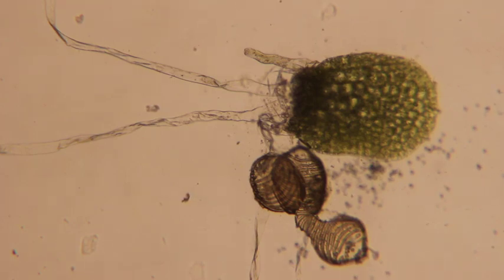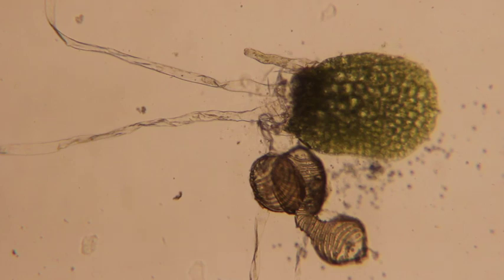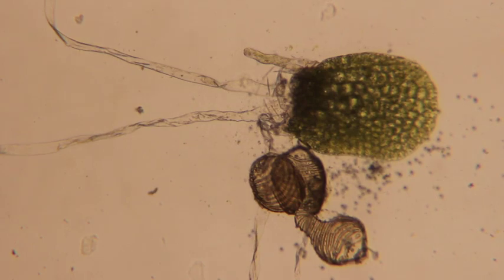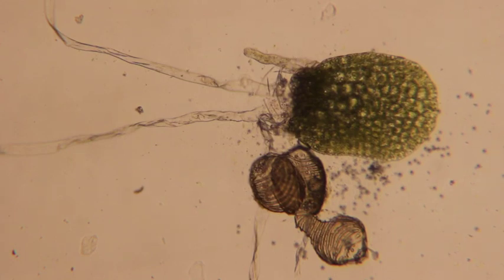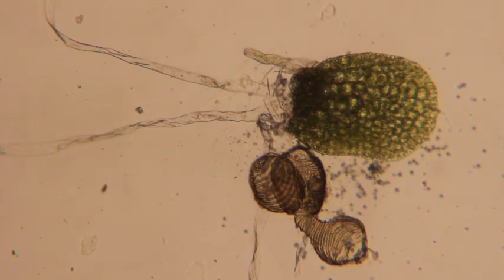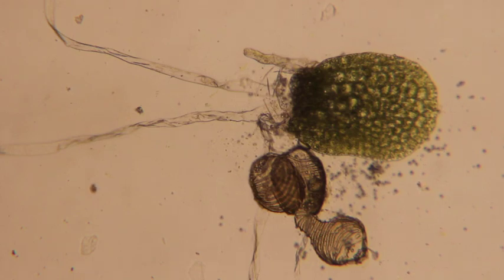You can see all those root-like things being rhizoids. The spore coat is all the brown stuff underneath it — usually the spore coat is right at the base, but in this case the spore coat broke away a little bit, probably because of my scalpel. And then we can see a multi-celled green structure there. That multi-celled green structure is a gametophyte. The fact that it's multi-celled is important. 'Phyte' means plant, and 'gameta' means the part of the plant that is going to make the gametes.